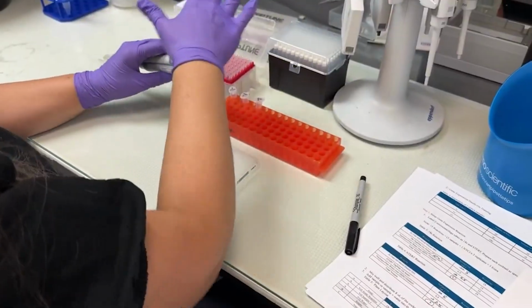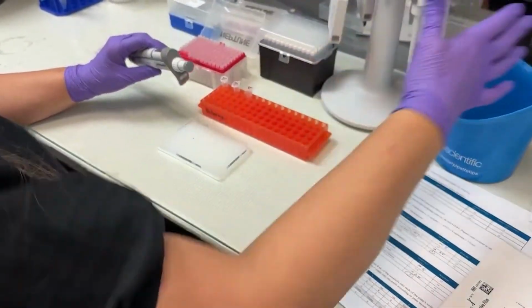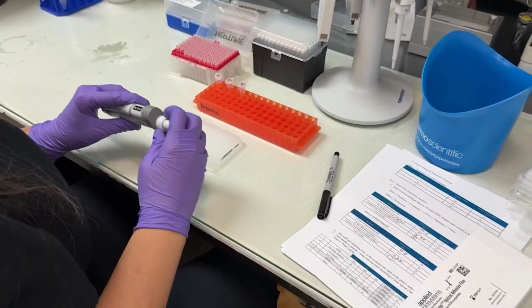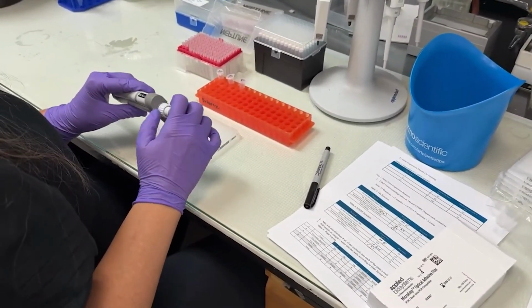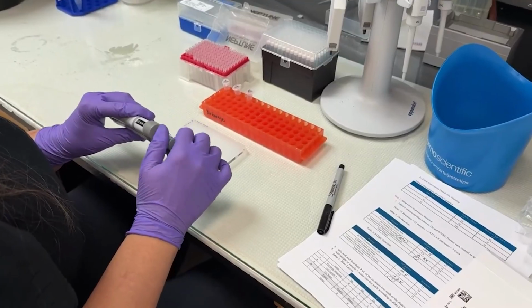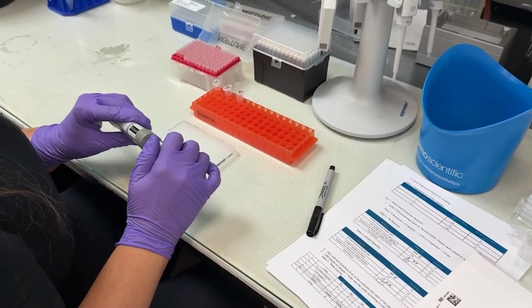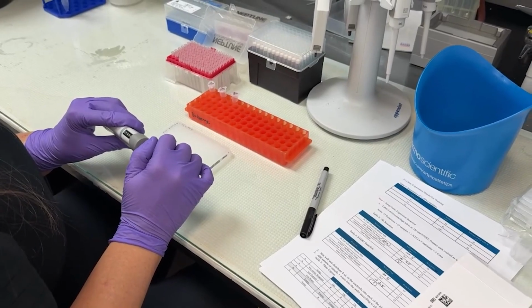I like my tips and my waste container on my right because I'm right-handed. So think ahead about how you're going to be working in this space and the things you need before you start. So to each reaction, I'm going to add 2 microliters of sample.